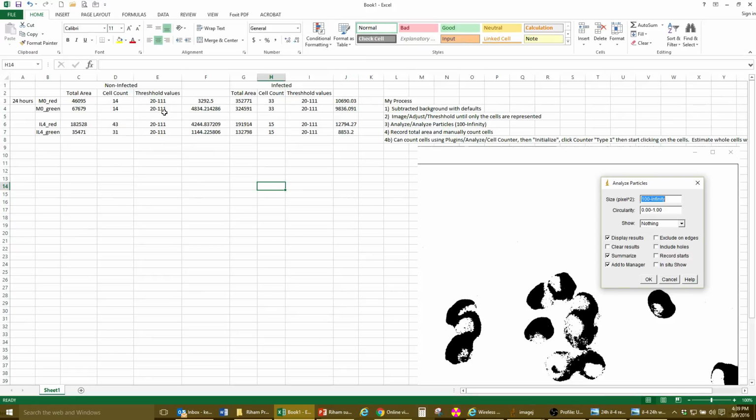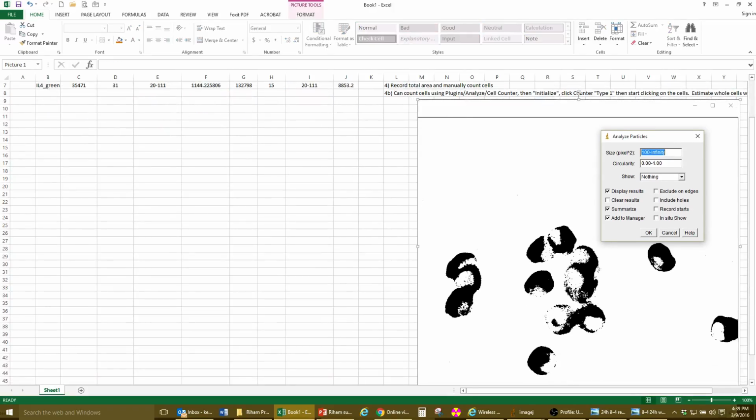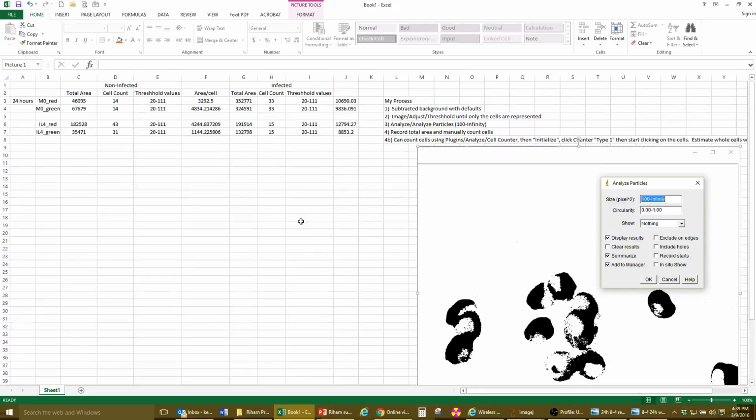So then what you want to do is you would go through and of course plot. This is area divided by cell, and so we're not really measuring intensity. What we do is we isolate the intensity by, if you read my thesis, I talk about it more there. But qualified area, so used to isolate what we're looking at.